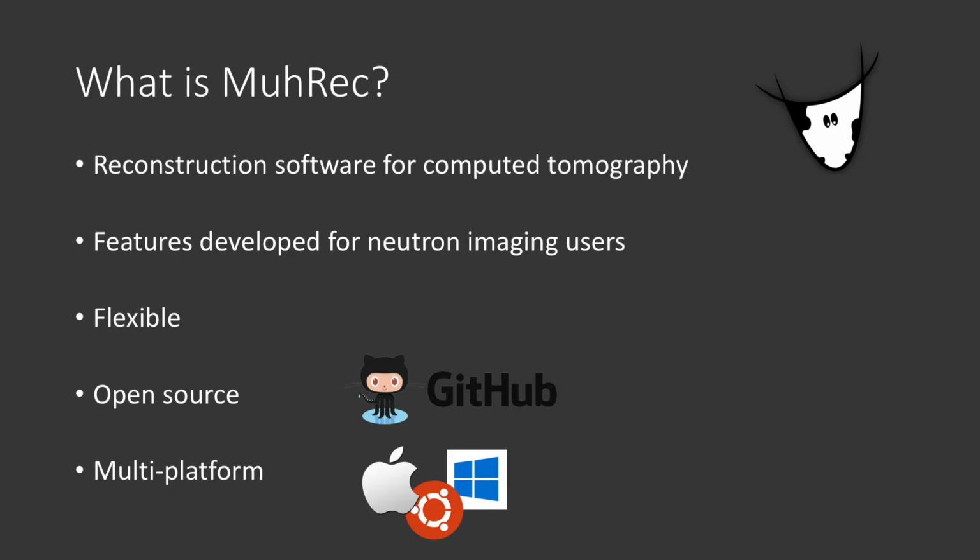Now let's take a look at the different views of MuhRec. In the new release we have changed a lot on the user interface, therefore I think it makes sense to walk through the views that you will work with.